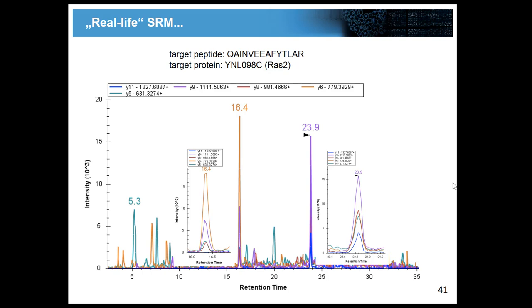But I think the people who didn't raise their hand are actually the right ones, because you can really not tell by these 2 peaks to be really sure which one it is, right? You're absolutely right. So the blue transition here is 0. We have only 4 transitions, and here we have 5 transitions, and you're absolutely right. It's very good, not many people got this so far.